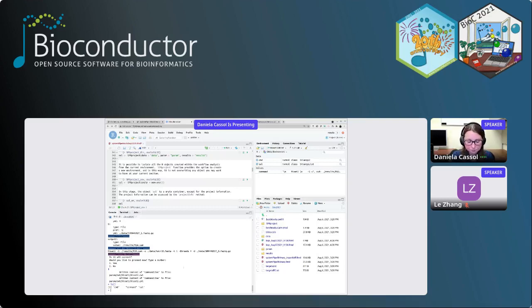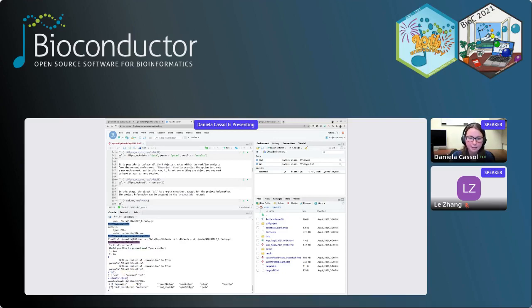However, you can have access to those objects, right? So we have a function called viewEnvir, and then sal. I pass the name of my workflow object, and then you can see all those objects we just created when we ran the workflow.